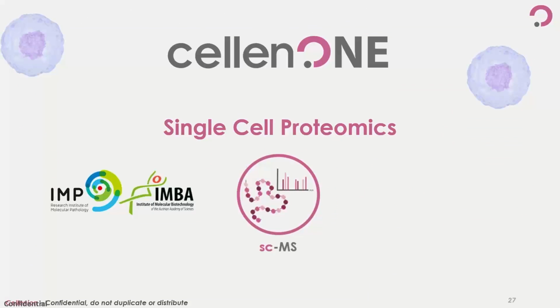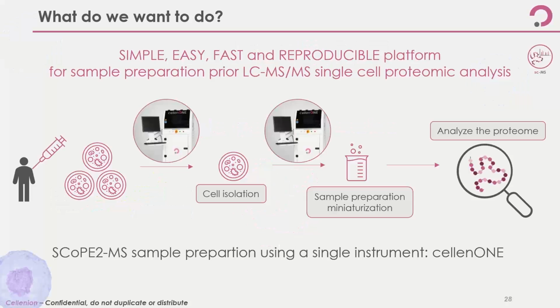So now, the core of the webinar, which is single-cell proteomics. This is work that we did in collaboration with the Institute of Molecular Pathology in Vienna. What we want to do is to provide a simple, easy, fast, and reproducible platform for sample preparation prior to liquid chromatography, tandem mass spectrometry, single-cell proteomic analysis.